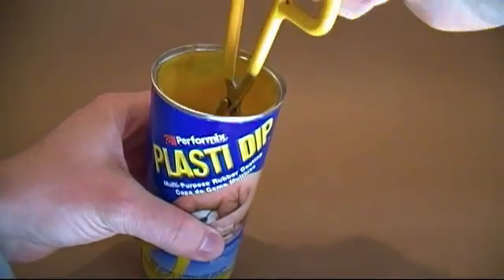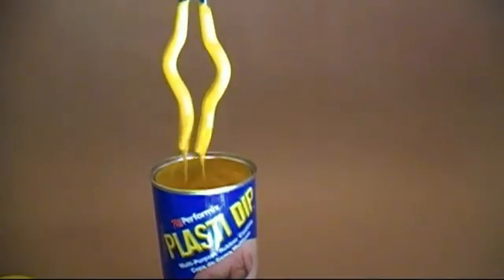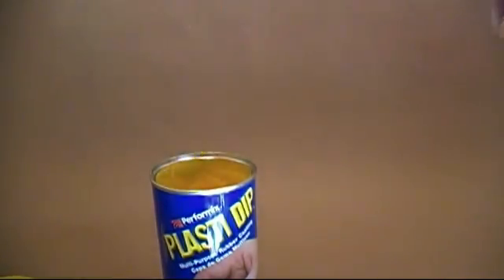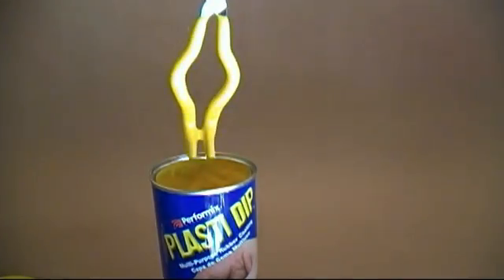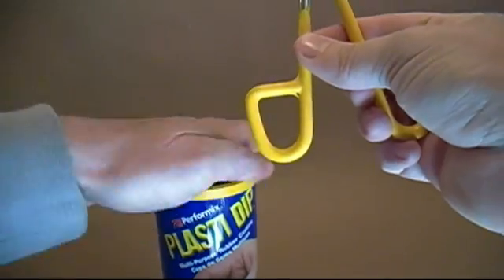It is very simple to apply. Just dip the part you want to cover in it, then remove and let any excess drip off. Afterward, continuously rotate the object for about 3-4 minutes to keep any drips and runs from forming. Then just hang them up to dry. You can then use a knife to remove the coating from any place you didn't want it.